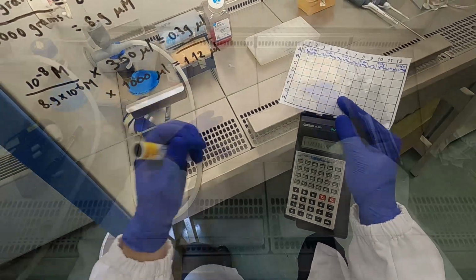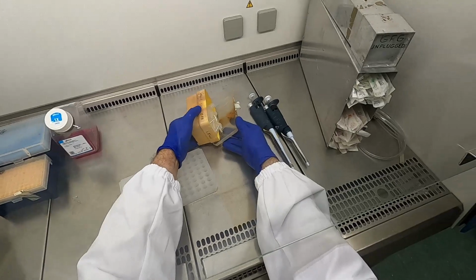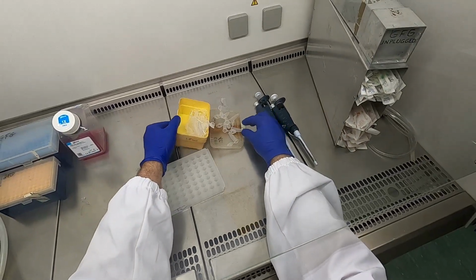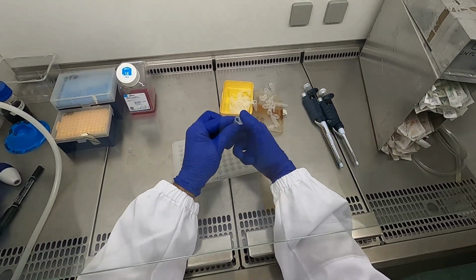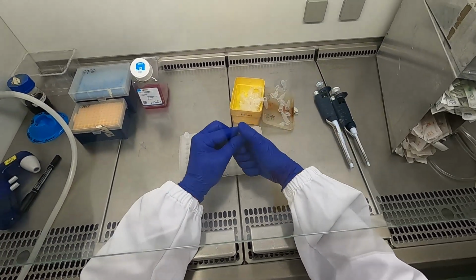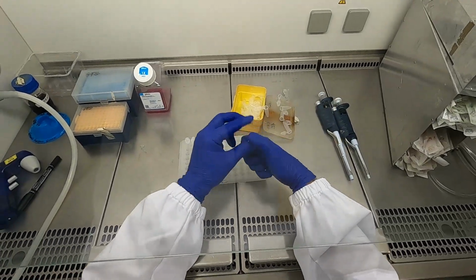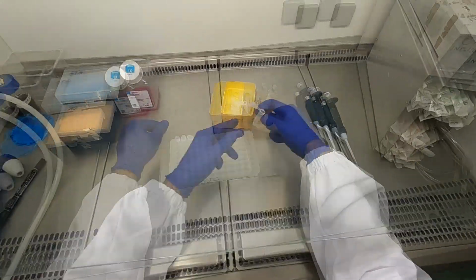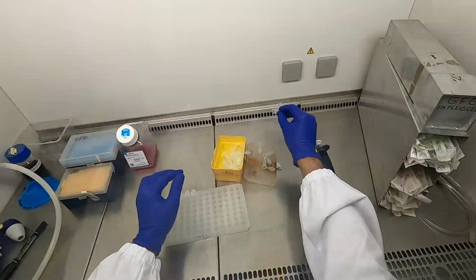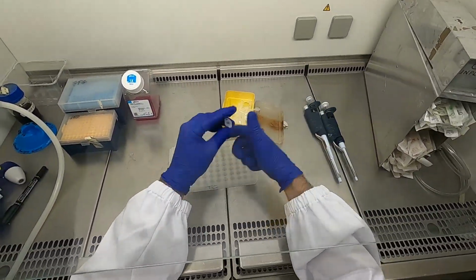Okay, let's take the tubes that we will need for the dilution series. The tubes come from this box, which is autoclaved, so the tubes which we call Eppendorf tubes, which can contain up to 1.7 ml, normally we call them 1.5 ml Eppendorf tubes, are sterile. So in order to keep them sterile, which is essential for the experiment, we handle them very carefully.